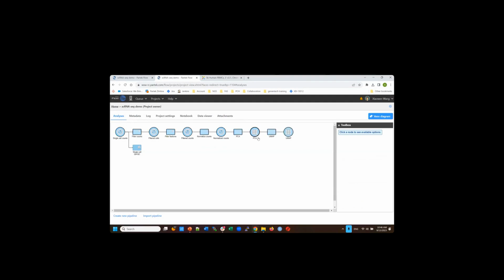Okay, and also based on PCA, you can do t-SNE also. Today we don't have time, so I'm not going to do t-SNE. But if I click on the UMAP, this data node contains UMAP scores, it does not have gene expression, and PCA is the same. You only have PC scores for those 1,000 cells. There's no gene expression. Just remember that.